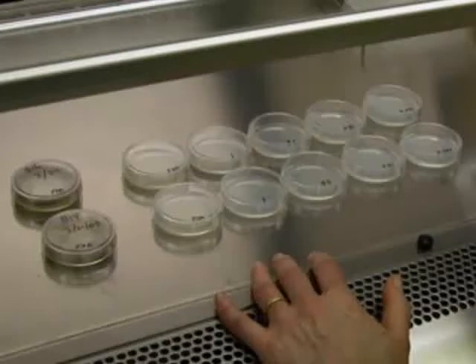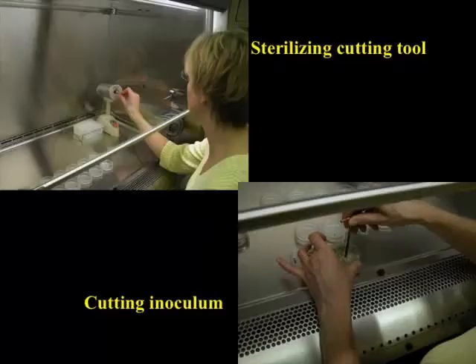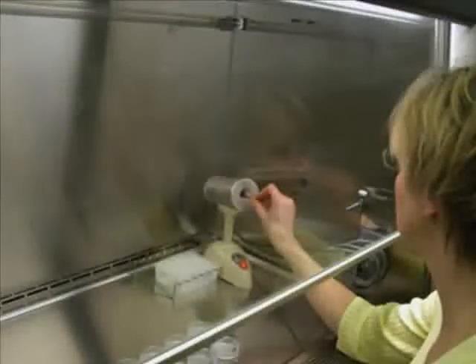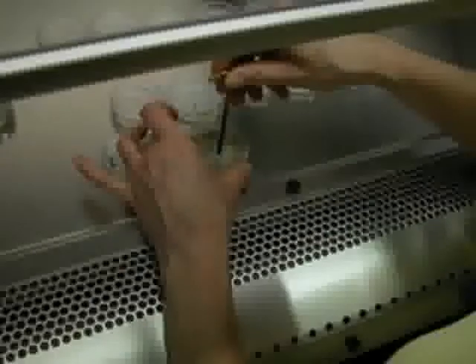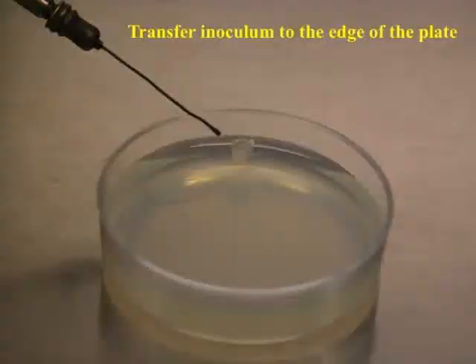We calculated how much fungicide needed to go in the agar. We melted the agar, applied the fungicide, mixed it in, and then poured the plates and let it solidify. And in the meantime, we grew B16 and B1728 separately in plates, and then used a sterile cork borer to cut plugs of the growing fungi from the plates. Then we used a sterile needle and transferred a plug of inoculum and put it fungicide down on the edge of the agar plate in order to start the test.